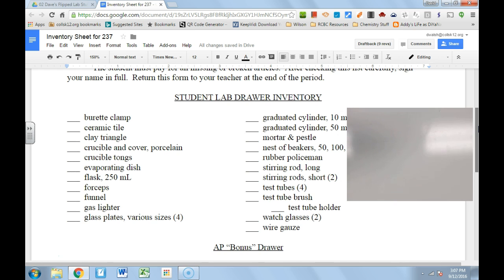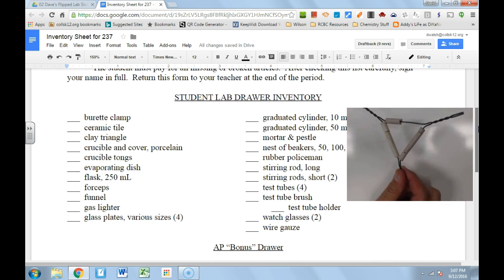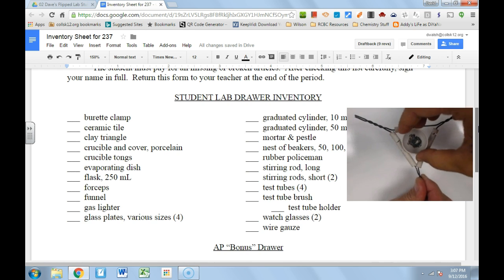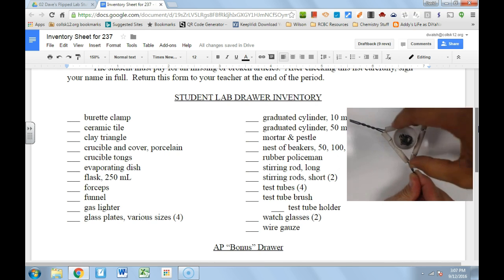And then we have a clay triangle — it is triangular. This is used to put things near a Bunsen burner without placing them directly on it; you put things in it and support them. Mr. Weingrad can show how a crucible goes right in there — the crucible fits right into the clay triangle and sits there perfectly.